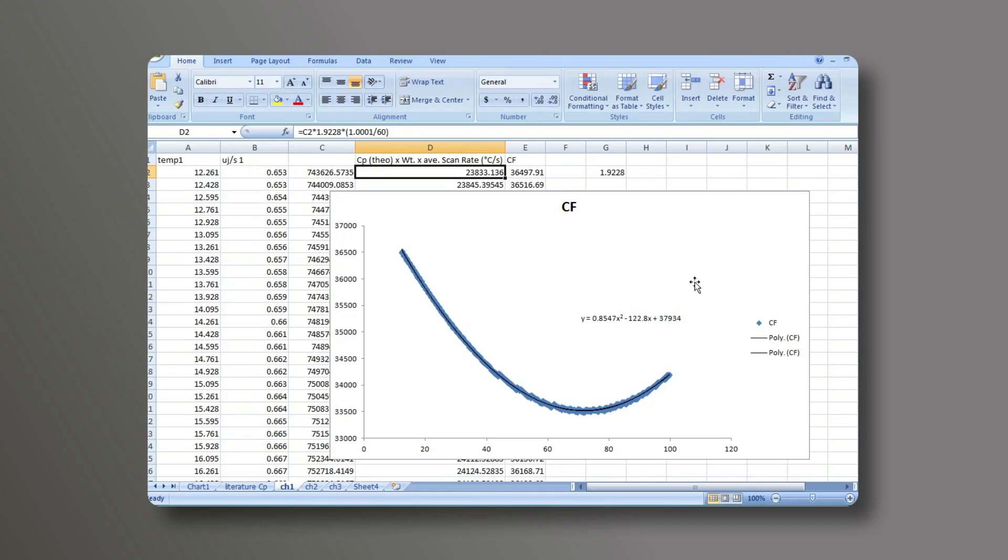After all three data sets are processed of the three different ampoules, now the coefficients A, B, and C are then loaded into the MCDSC run software. And the instrument's been calibrated for those specific ampoules.